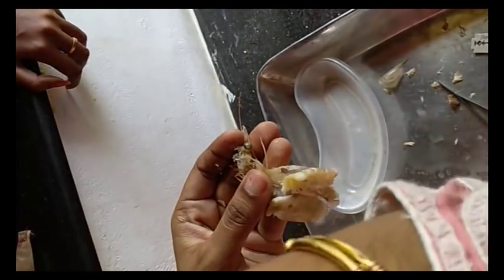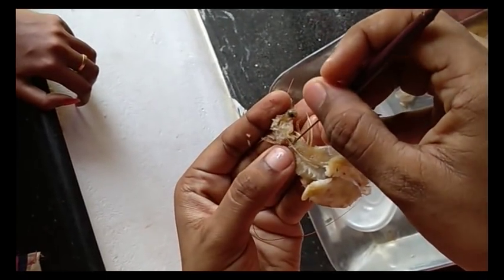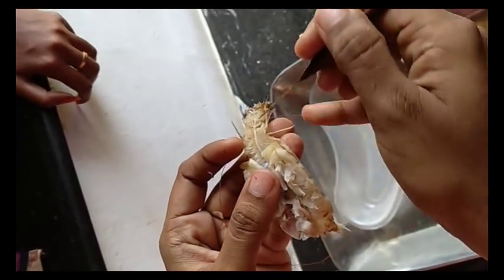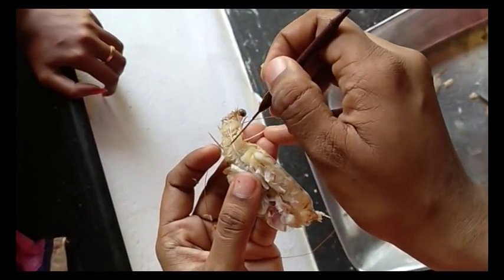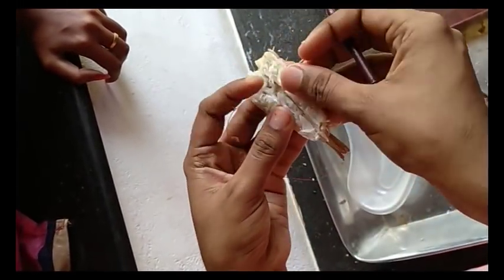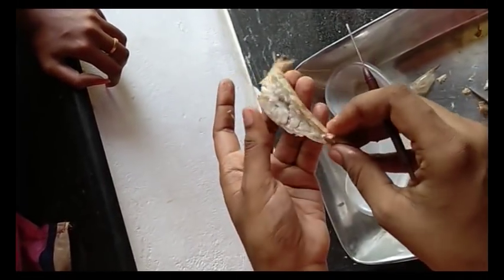This is the supraesophageal ganglion or the brain of the prawn. Circumesophageal connective. Subesophageal ganglion. And here you can see the thoracic ganglionic mass. So many ganglia are clustered together to form the thoracic ganglionic mass, which coincides with the thoracic region. And down you can see the abdominal ganglion and the ventral nerve cord, which runs to the tip of the prawn.